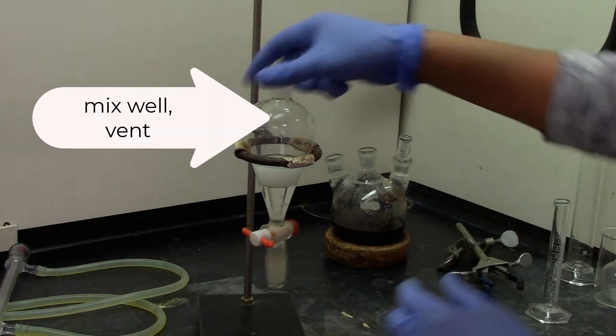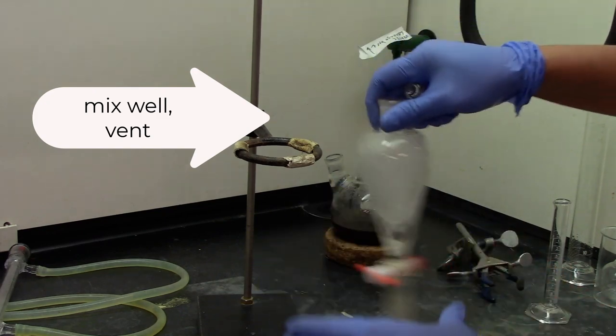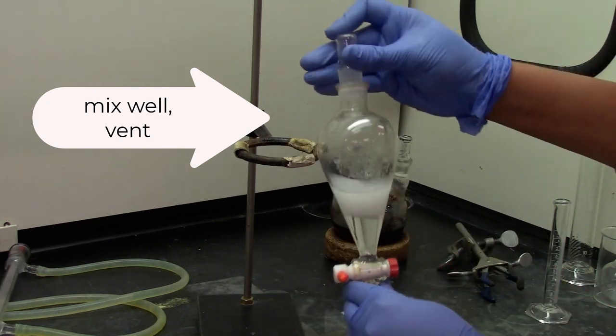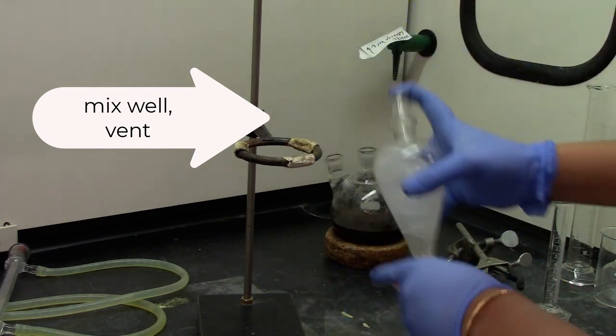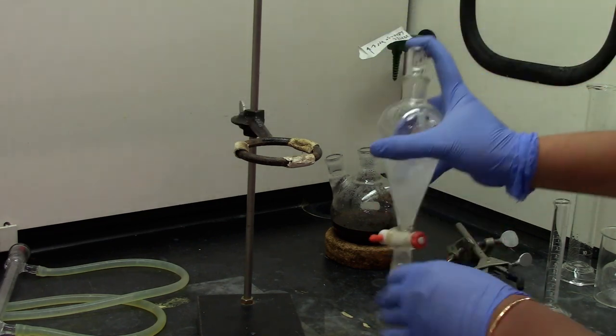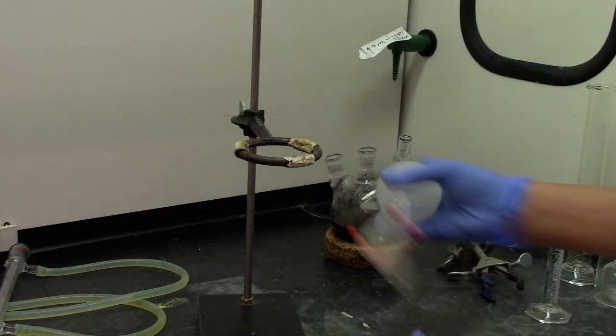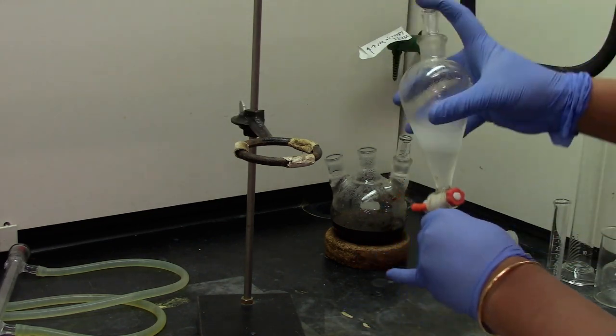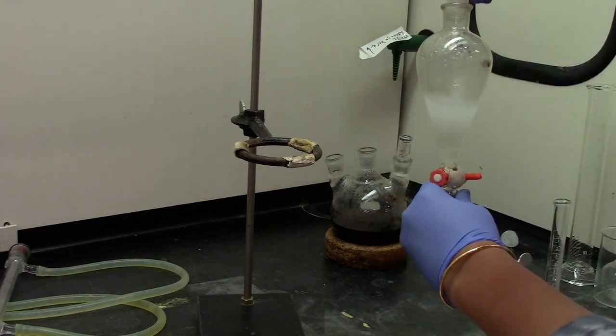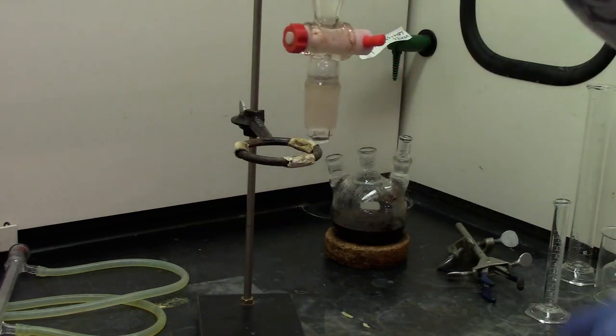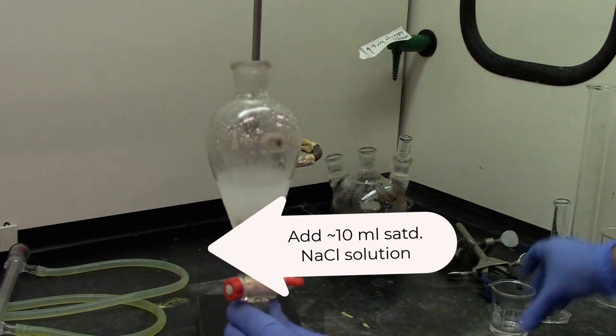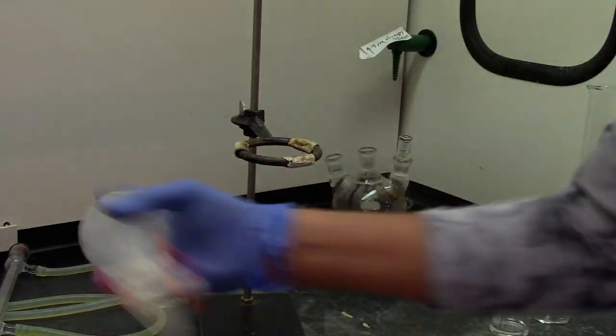Cap the separatory funnel and give it a good mix and vent. If you see an emulsion like here, both the layers are cloudy, go ahead and add about 5-10ml of saturated sodium chloride solution, which helps break the emulsion.